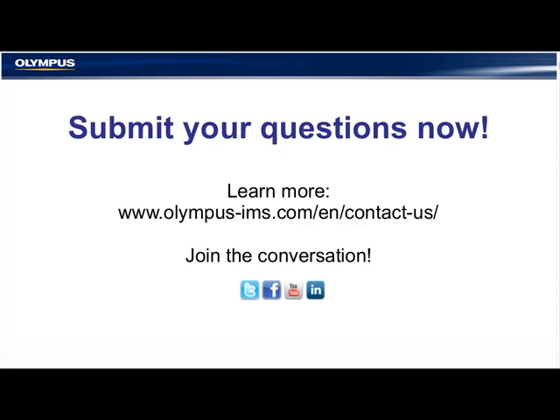I believe the name of the company is Analytical Reference Materials International, and they are excellent. They have all sorts of certified materials that we can either purchase for our customers or point our customers to them. I hope that answers your question about references. We have another question coming in.